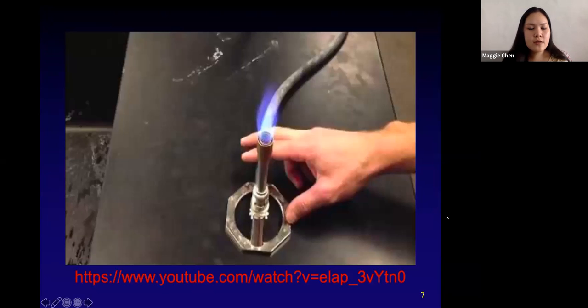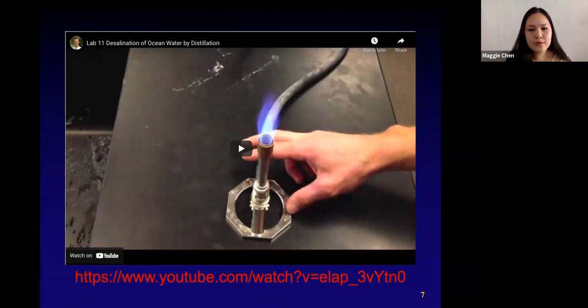So this video is going to walk you through what it would look like to do the distillation process in lab. It's also on your Canvas page. It's around 10 minutes, but there are some differences between how we would have done it and how it's done at USF. Like they use Bunsen burners, we use hot plates, and there are some differences in units, but generally everything is pretty much the same, the concepts are the same. But yeah, I will now play this video for you all and we can see what it would look like in lab.